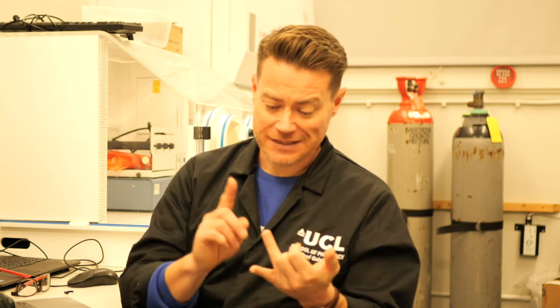Now I said, if you use this in combination with hot stage microscopy, you really can start to interrogate samples that you've studied by DSC. So let's think of the sorts of questions that you might ask by DSC. Is my sample amorphous or crystalline? Does it melt? Does it recrystallise? Does it go through multiple polymorphic forms before the highest one melts, or whatever? You might have a whole series of peaks and you don't know what they correspond to.